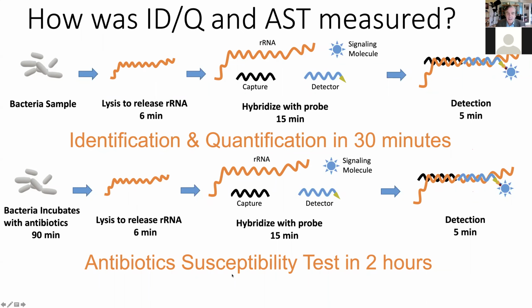Now, the antibiotic susceptibility test is remarkably similar. You see, you do all the same, except you do the incubation in the presence of antibiotics. And you can see all the other steps are identical, which is very good, right? Because now you can use the same element on your CD to do both.